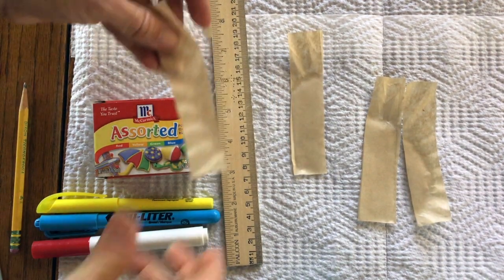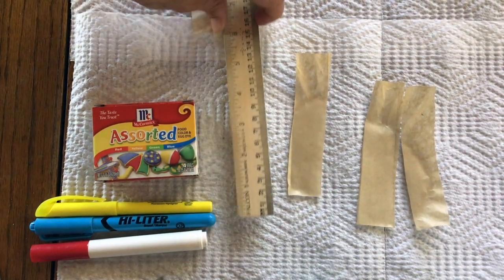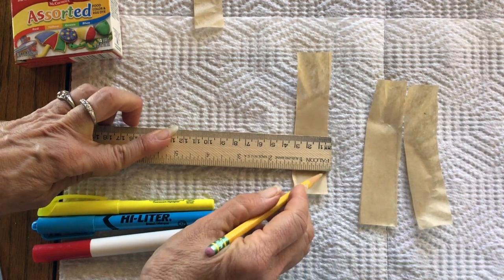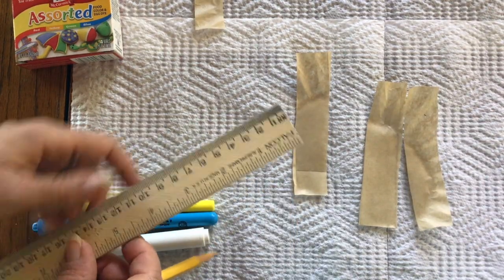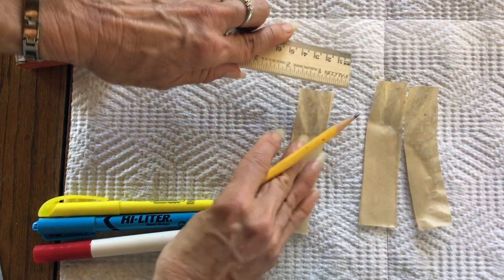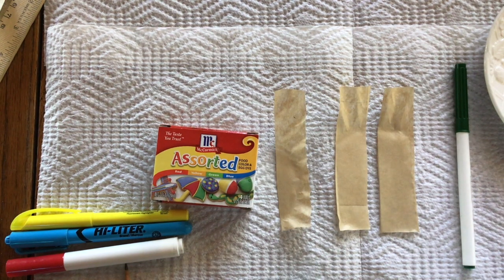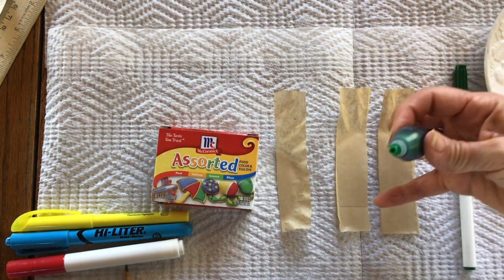Take one of your papers to set it up. From the bottom of your paper, go up about two centimeters and draw a line across. This is where your food coloring will go, placed in the center of that pencil line. From the top of the paper, go down about one centimeter and draw another pencil line.